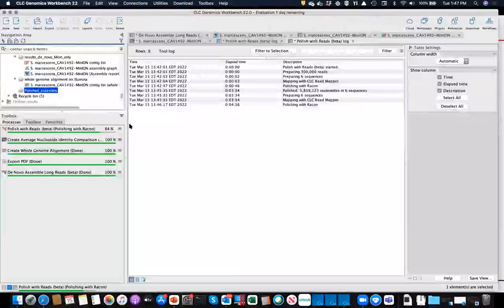And while we're waiting, Sean, it looks like one of our attendees had a really interesting question. They wanted to know if it's possible to assemble long and short reads in one process, or is it better to separate them like you've demonstrated here?